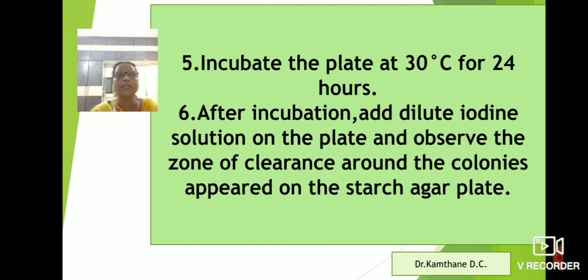After incubation, colonies will appear. Flood dilute iodine solution on the plate and observe the zone of clearance or zone of starch hydrolysis around the colonies appeared on the starch agar plate after incubation.